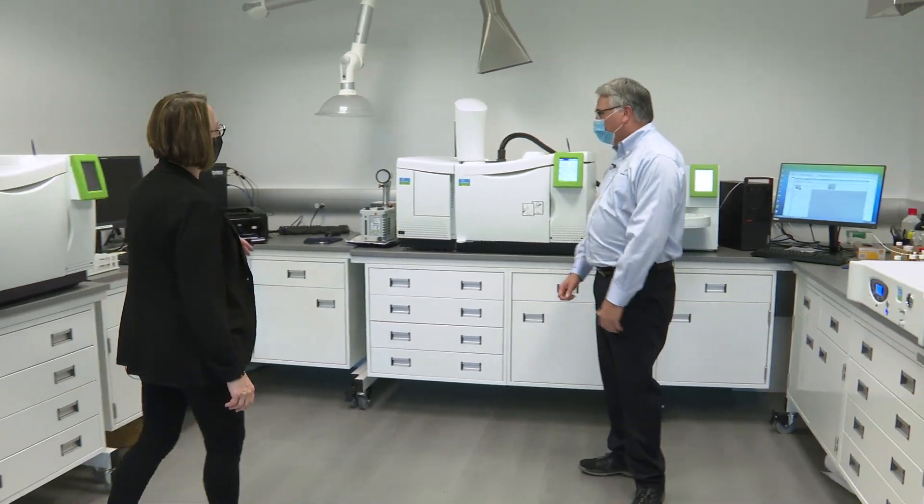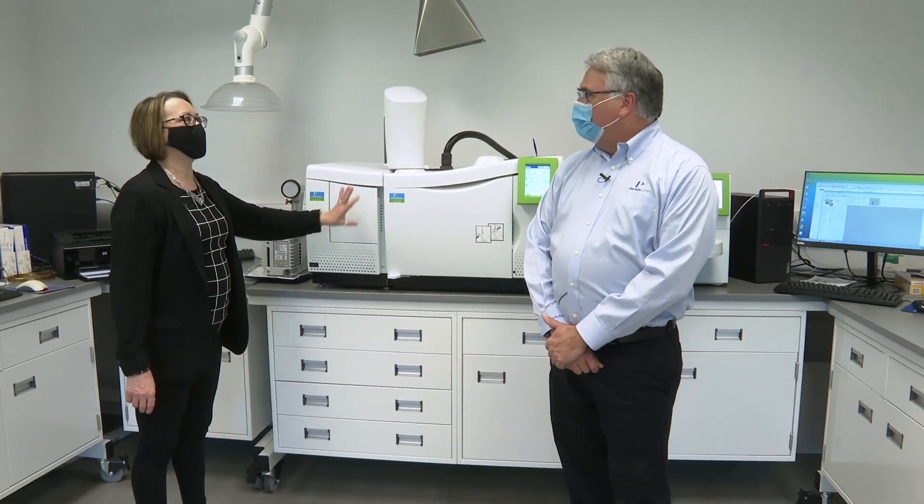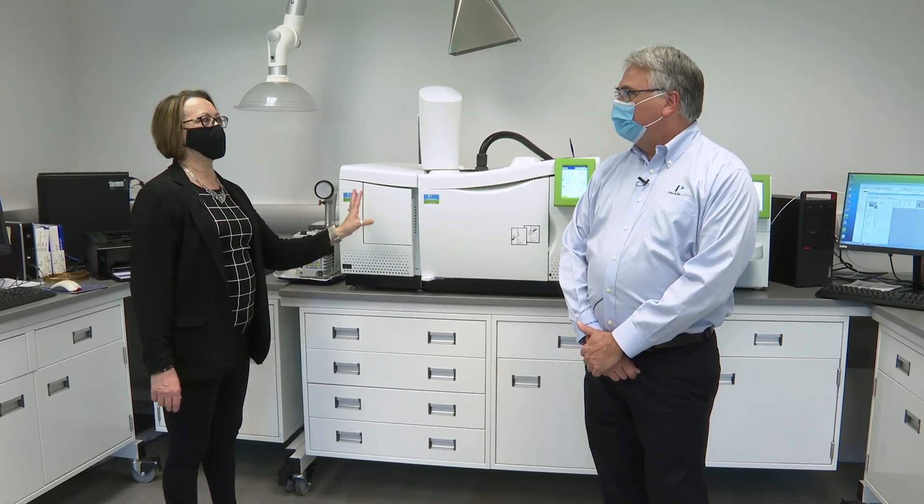We happen to have, actually, its predecessor, the 680 right here. And you can put a mass spec on these various models, right?